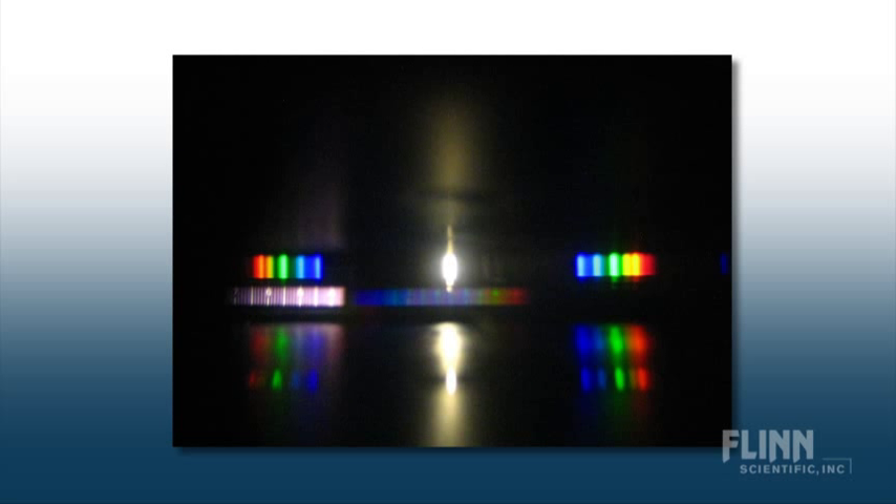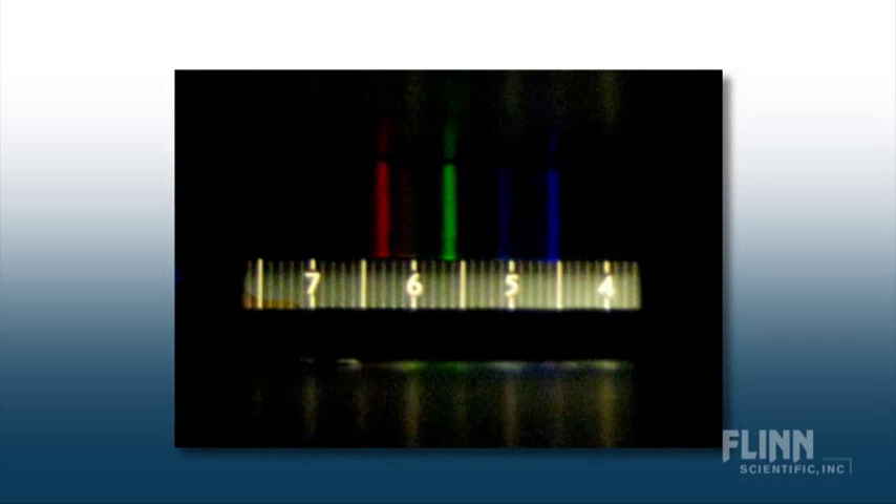A diffraction grating separates light entering the spectroscope into its component wavelengths or colors. The numbered scale allows students to measure the wavelengths and to identify the elements producing the spectrum.